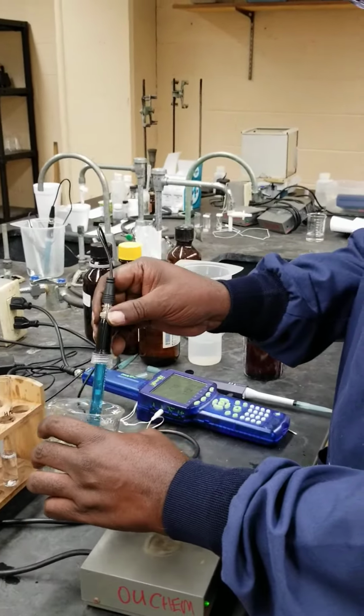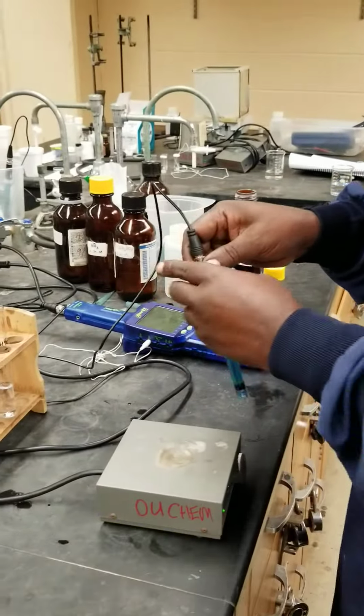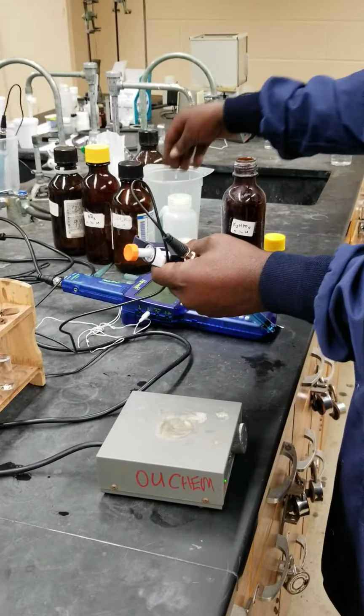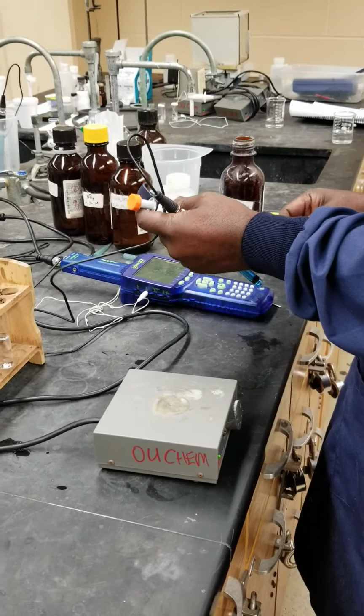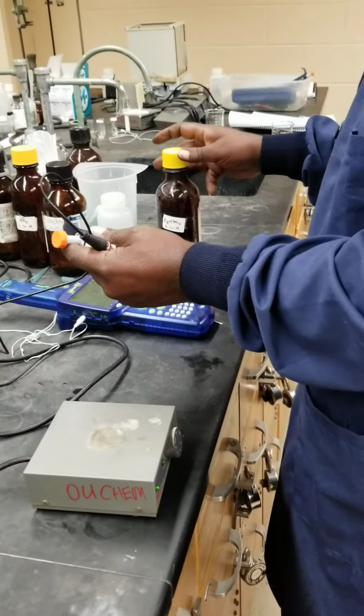Rinse in distilled water. Change the pipette tip. Move this out of the way.